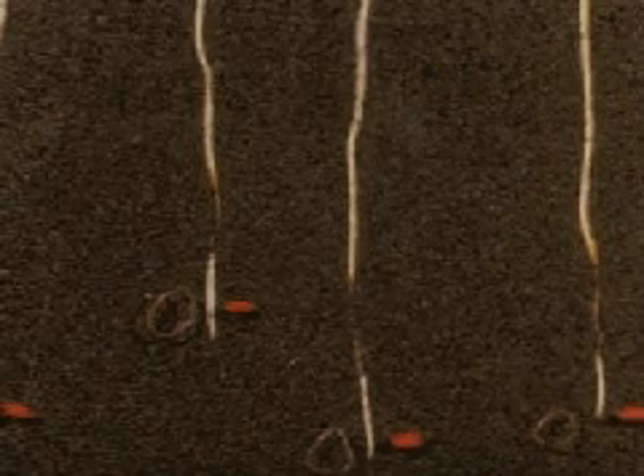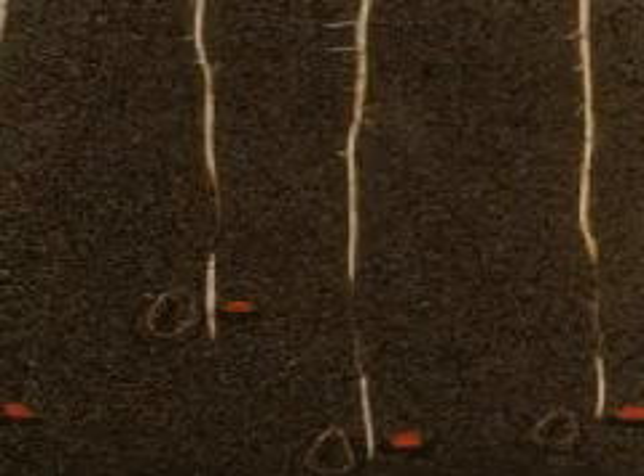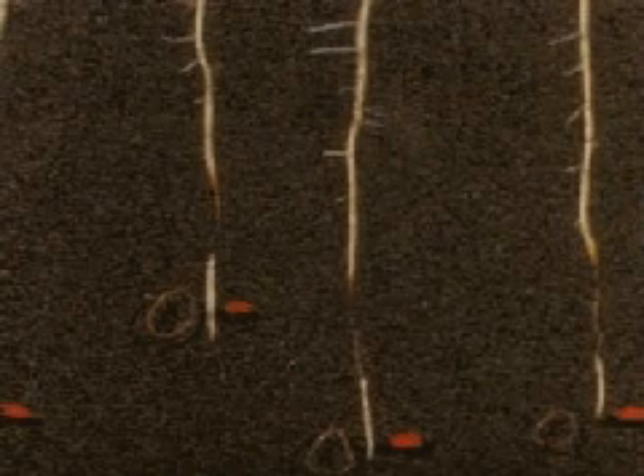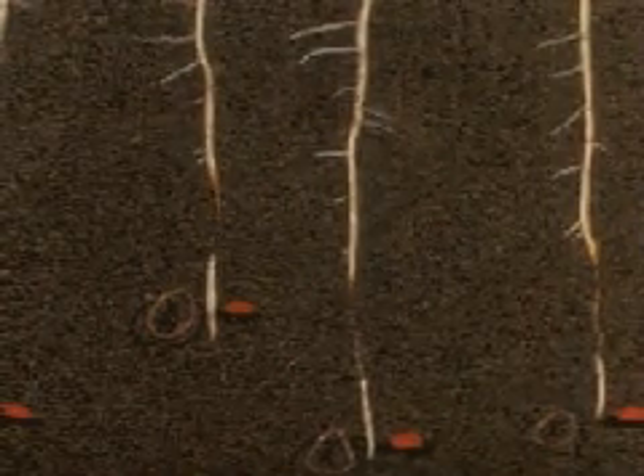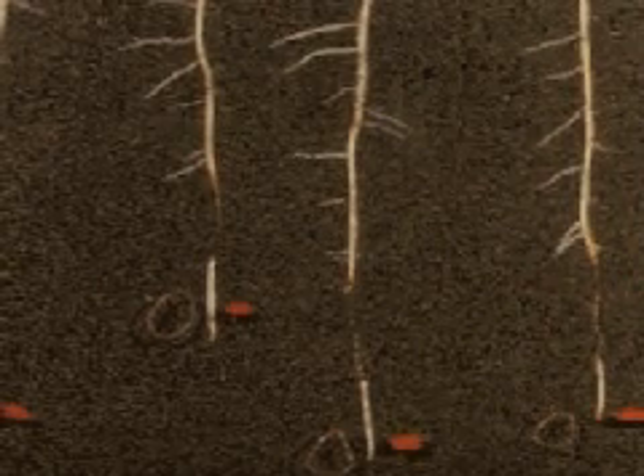The steel — certainly alive — because lateral roots are produced on the tap root wherever there was mature tissue at the time of treatment with nitrogen gas. This sequence shows details of the effect of anaerobic conditions on root growth. The sign which says 180 remains in the field for the duration of the 180-minute treatment with nitrogen gas. Then when the sign is removed, air is again passed through the box. With a three-hour treatment, this root dies in exactly the same way as the roots in the previous sequence.